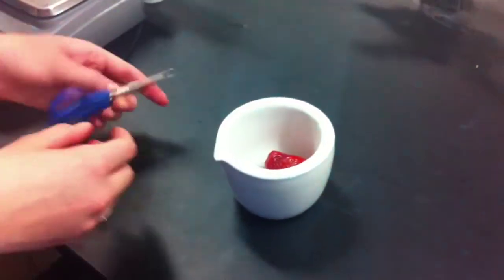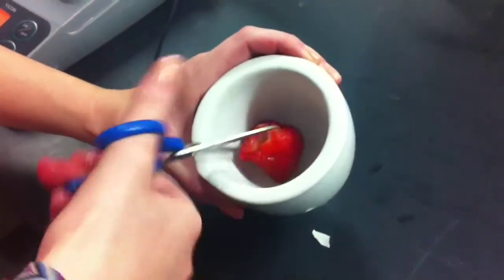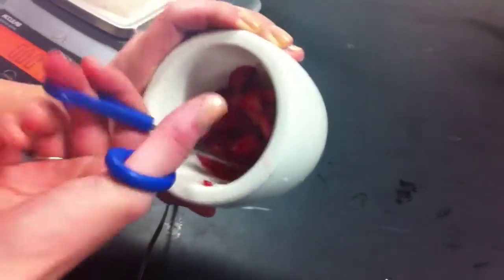Now we'll measure a solution. We're getting 24.39 milliliters of the extraction buffer, creating a 1 to 1 ratio between the extraction buffer and the strawberry.